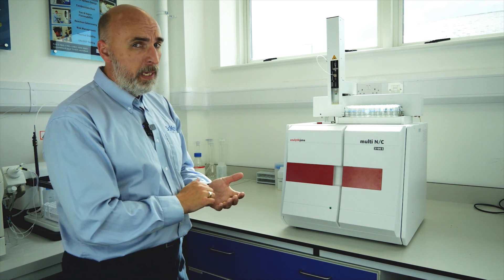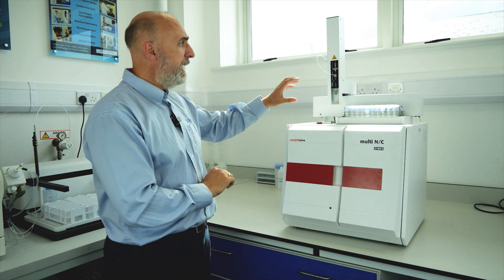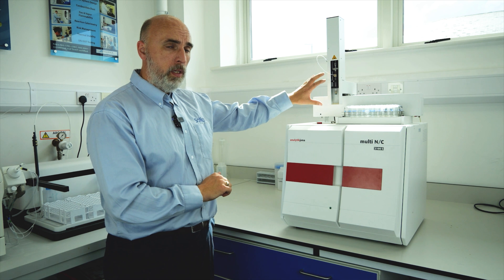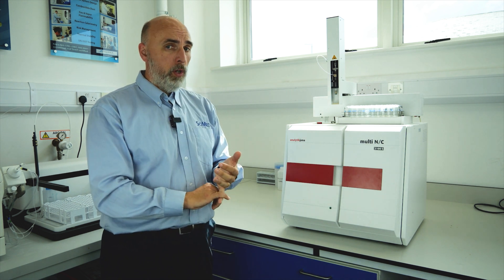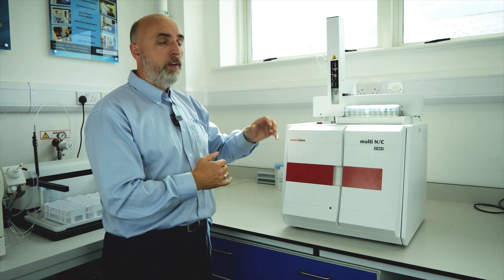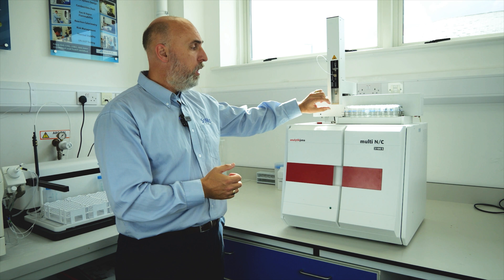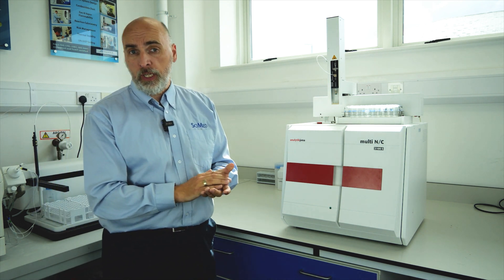I'm going to talk about some of the key features and key benefits that this system will bring you. This is the Multi NC 2100S, and as you may notice, the first thing is it's a direct injection mechanism. Although it is capable of working with clean waters at trace levels, it is great for heavier, dirtier matrices — picking up a small aliquot of sample and directly injecting it into the combustion chamber.